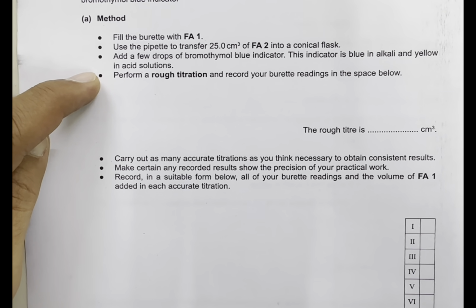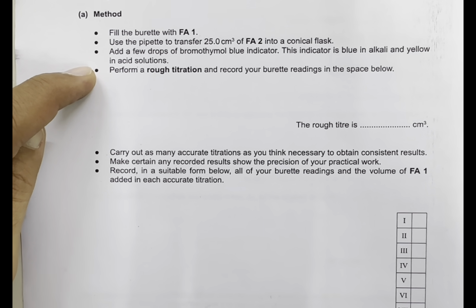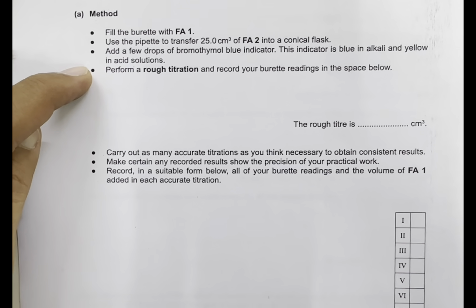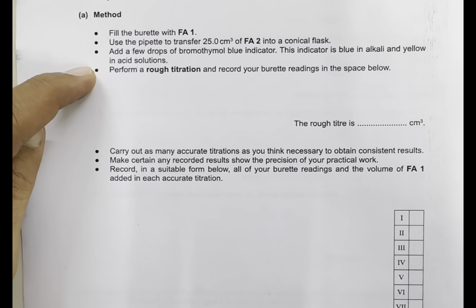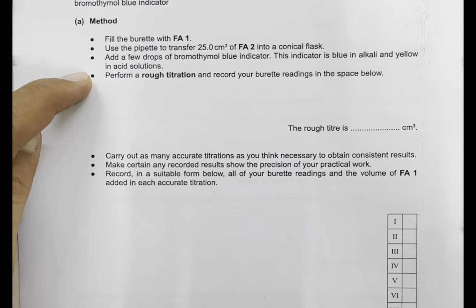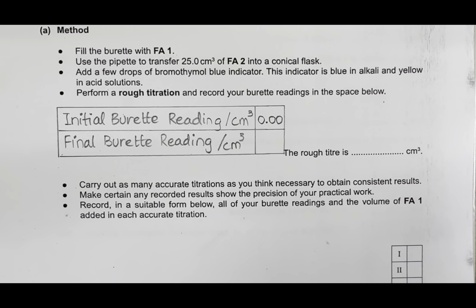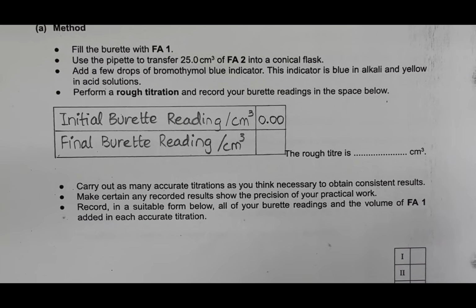Now the next point in the method is perform a rough titration and record your burette readings in the space below. So we will record first the initial burette reading, and then we will perform a rough titration. So the initial burette reading is 0.00.